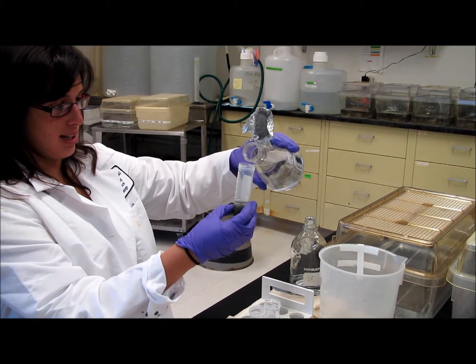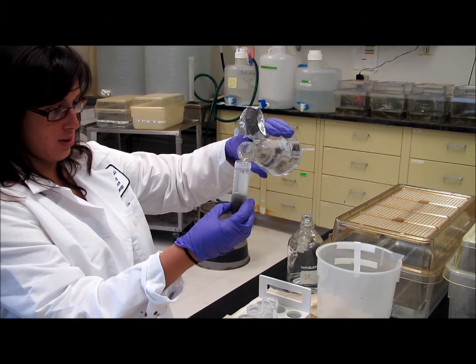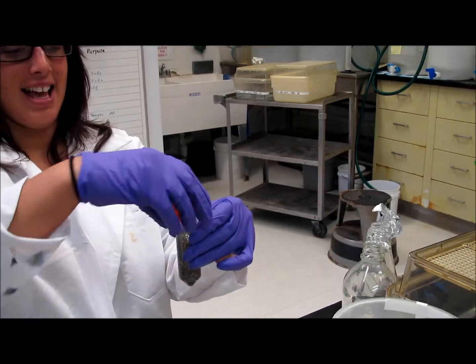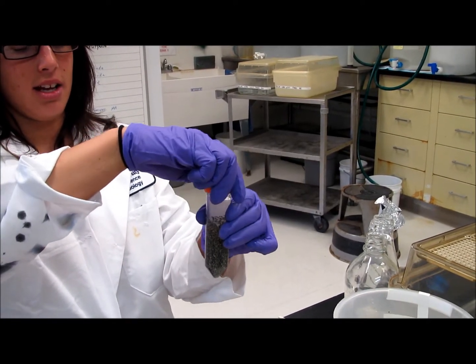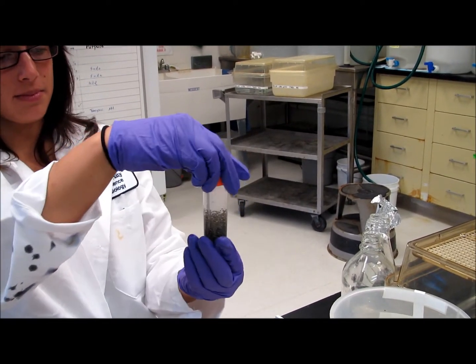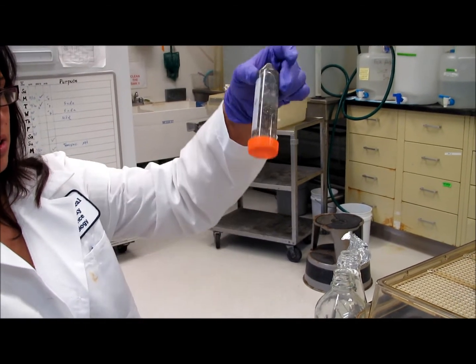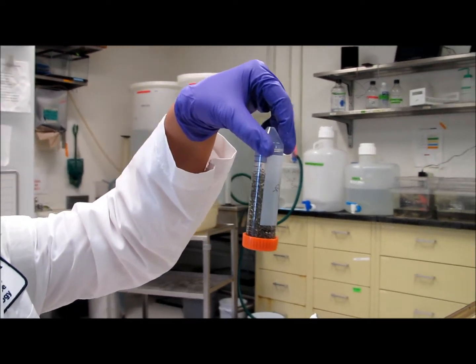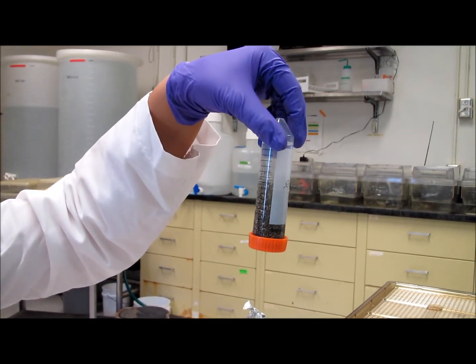Add 2% cysteine solution to the conical tube, pouring it to the top, and then gently invert the tube until the jelly coat is removed from the eggs.